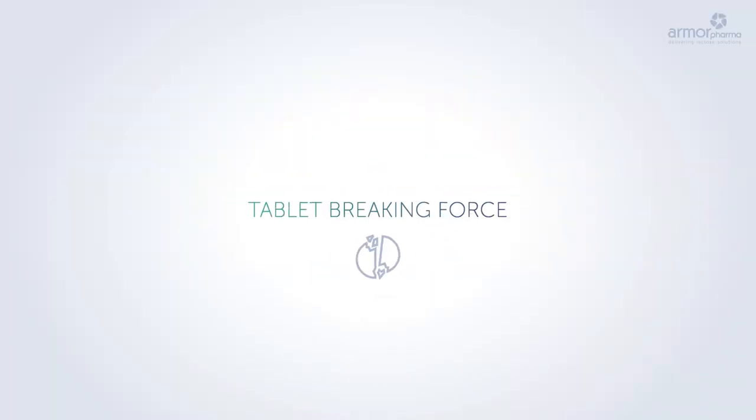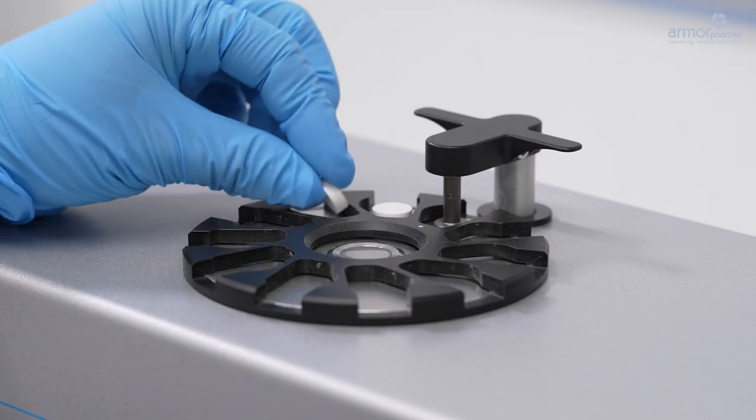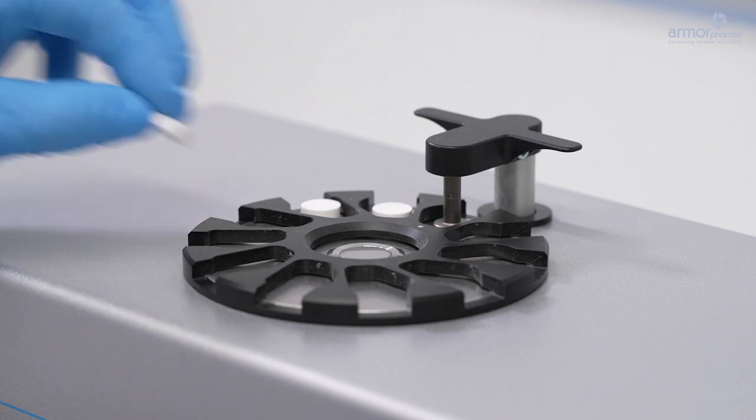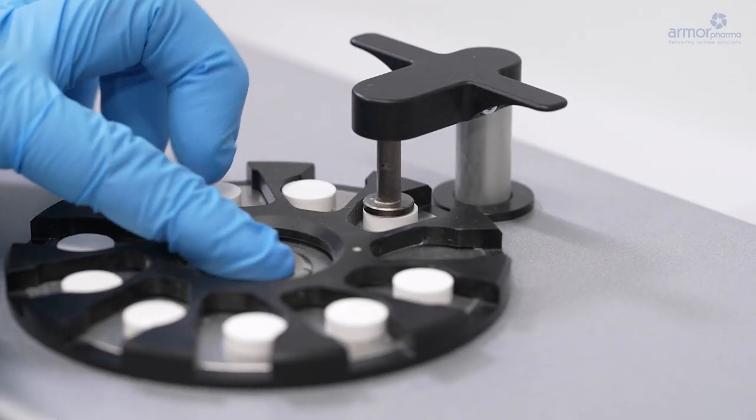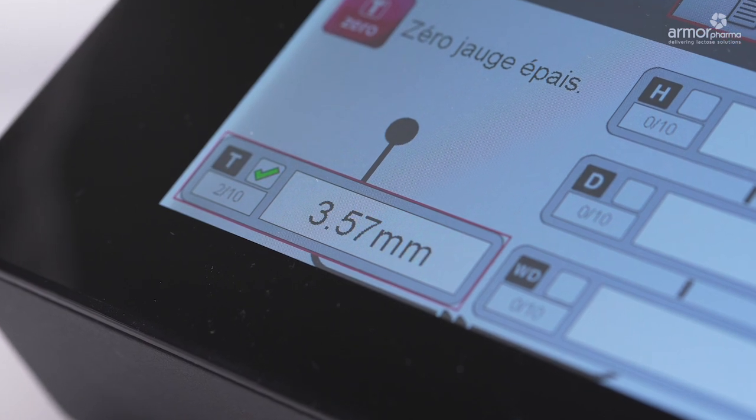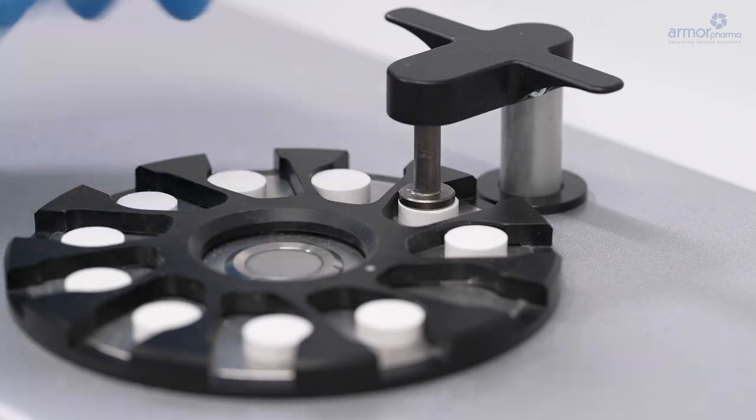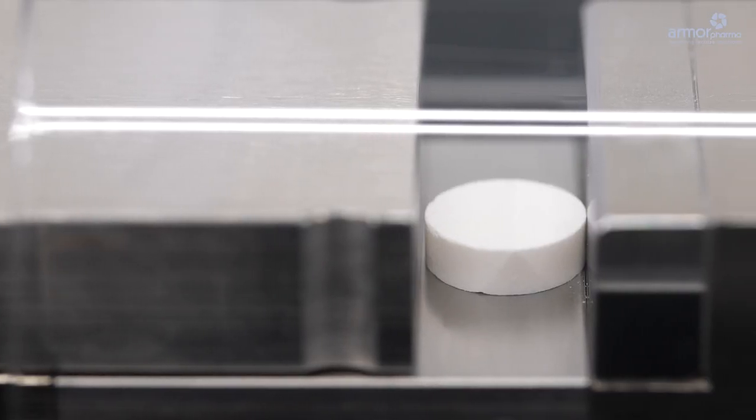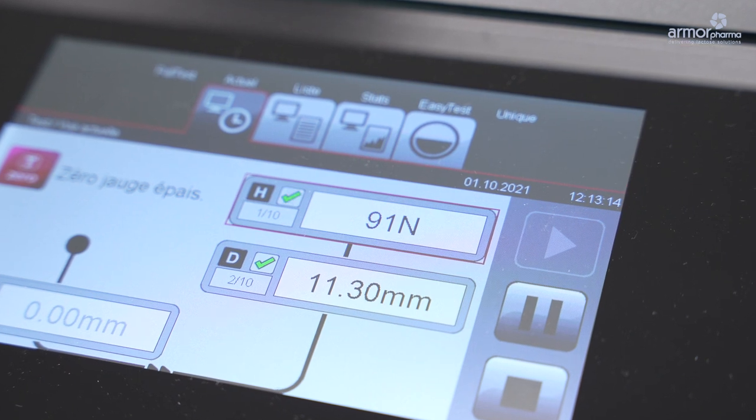Tablet breaking force: Once the tablet is produced, the tablet dimensions and breaking force are measured using a hardness tester. The aim of this test is to determine the force required to break the tablet. This will help to characterize the compaction properties of each formulation. The measurement is performed on series of ten tablets. An analytical scale determines the weight uniformity.